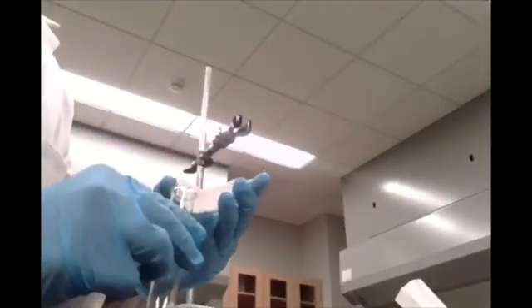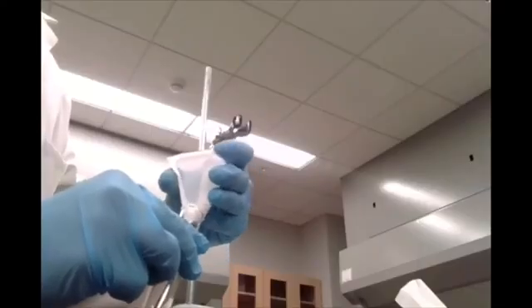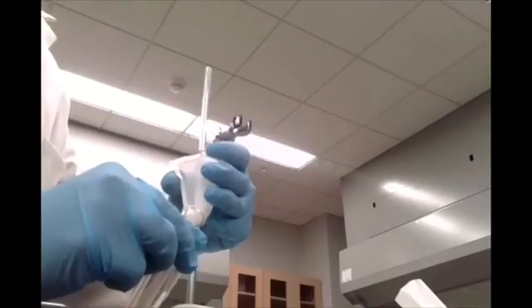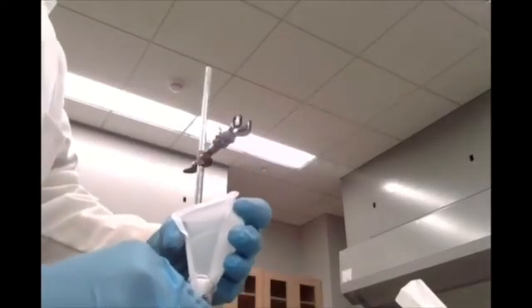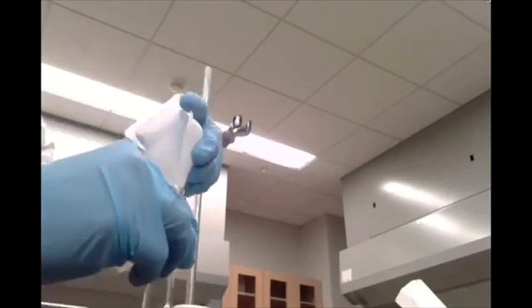You can see that all right. I'm being very careful to make sure I get all of the potassium nitrate from our weigh boat into our test tube.